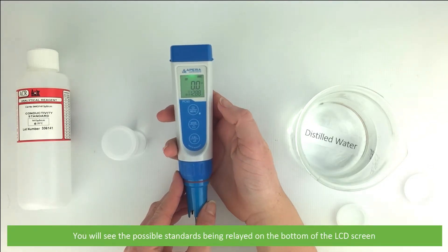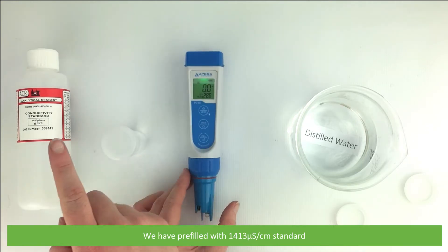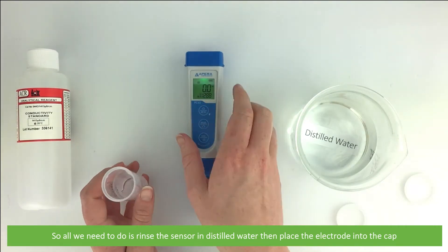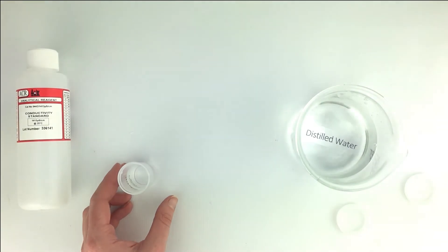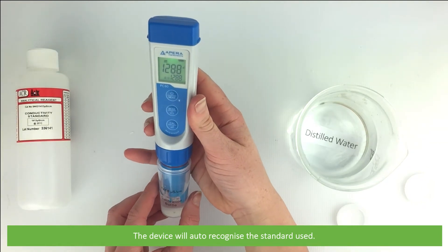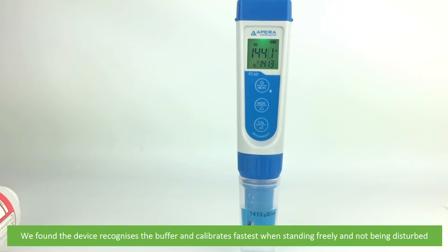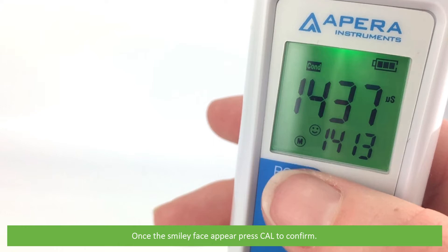You will see the possible standards being displayed on the bottom of the LCD screen. We have a pre-filled cap with our 1413 microsiemens per centimeter standard, so all we need to do is rinse the sensor in distilled water and place the electrode into the cap. The device will auto-recognize the standard being used. We found that the device recognizes the buffer and calibrates fastest when standing freely and not being disturbed. Once the smiley face appears, press the cal button to confirm.